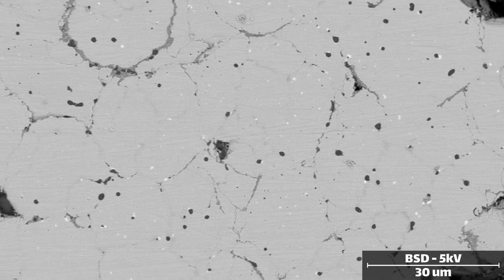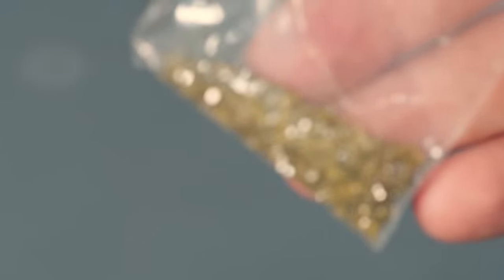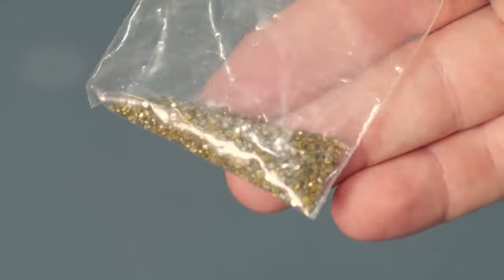And finally, ion milling is useful because it just doesn't care about the material that you're etching. Some materials will etch faster or slower, but they will all get etched given enough time. And that includes some of the hardest materials we know of, including diamond.